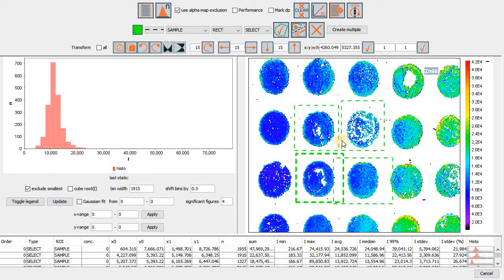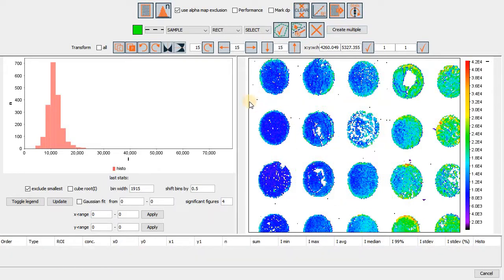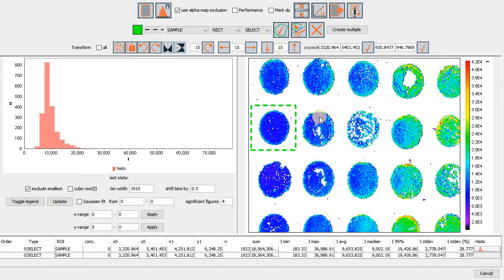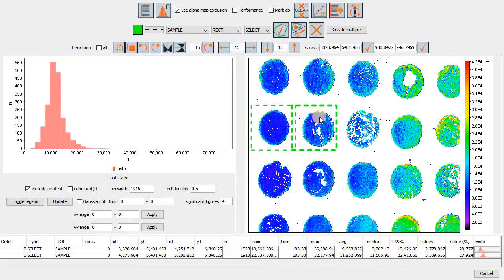And we can also export this data, like here we can export all the data to an Excel sheet. And if we want to, for example, copy and paste, let's say we delete all of these, because we just want to have the same size all the time. We draw it, and then we just do copy paste here, or we can do Control C and Control V, and then we can shift it just with the keyboard.